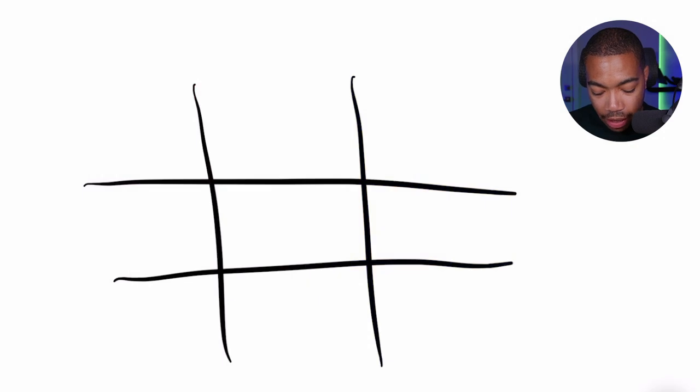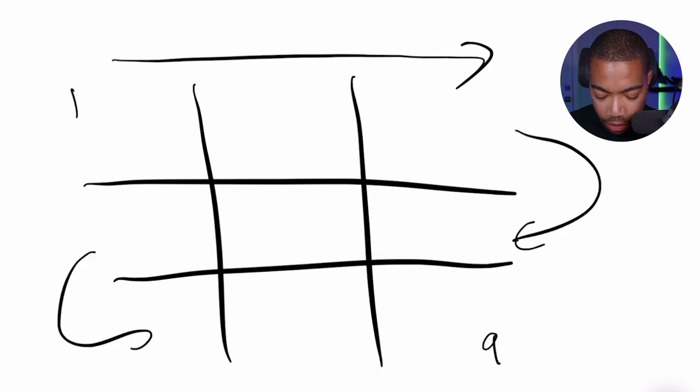So I've got 9 squares, 1, 2, 3 in the top row, 3 in the middle, and 3 on the bottom. And the idea is to go around with our near IR and look for which square has a defect. Now, if we have a defect here that I'm showing you with this black circle, it's pretty obvious visibly where this defect is occurring, and we would expect this particular sample to have a different chemical signature based on whatever detector we're using.